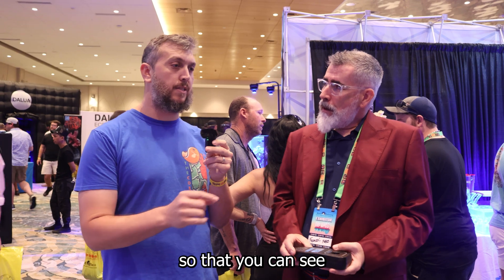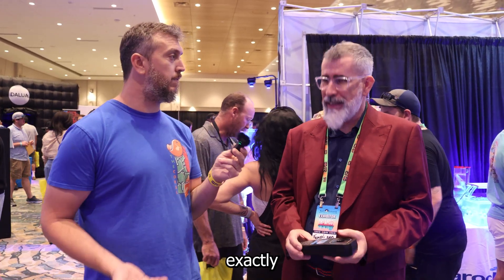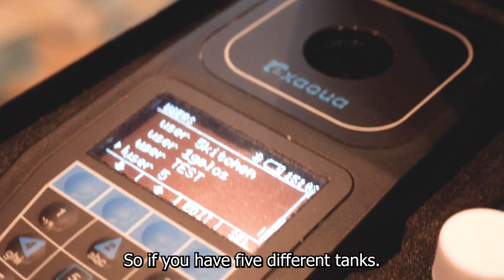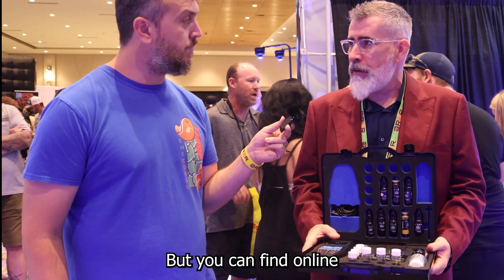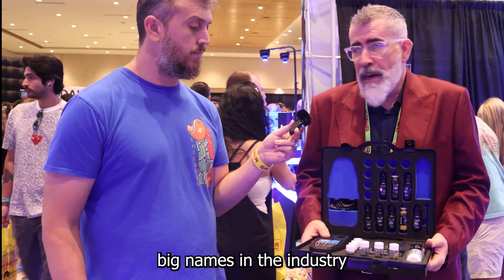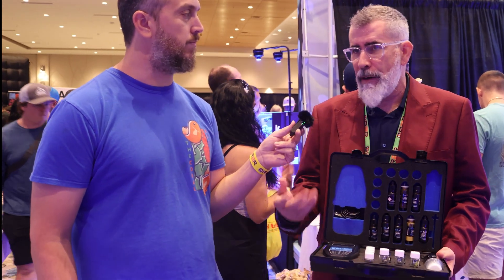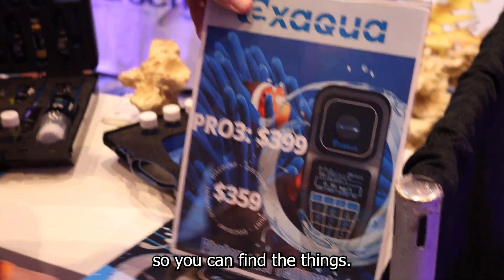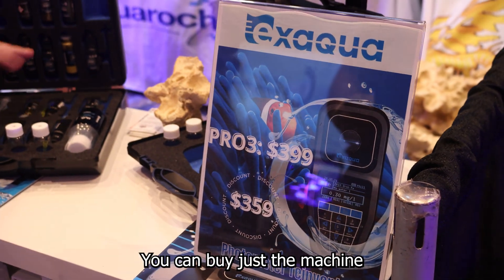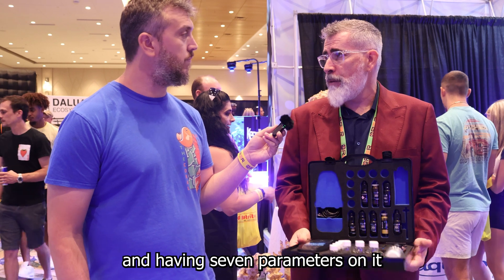It keeps track of everything so you can see trends in your tank and sends it to you by email. You can find it online through big names in the industry like saltwater.com, BRS, Aquarium Partners, and different stores — all listed under xaqua.com. You can buy just the machine and supply your own tests, or buy a kit.